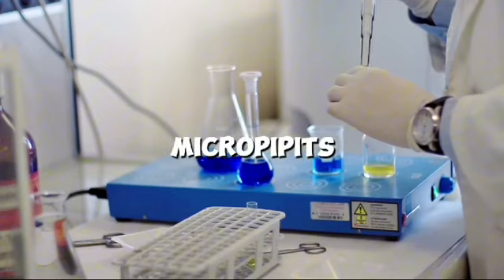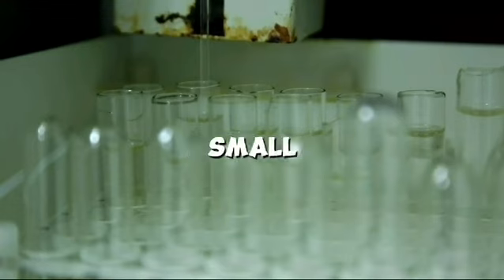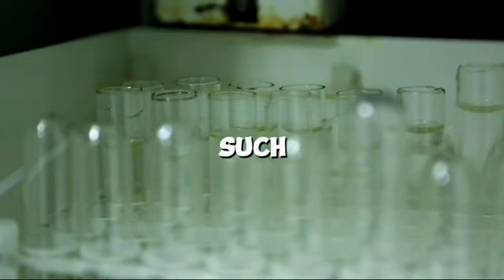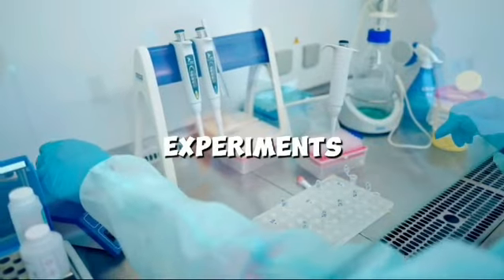Pipettes and micropipettes. Pipettes and micropipettes are used to accurately transfer small volumes of liquids. The precision is fundamental for many laboratory procedures, such as preparing solutions and handling samples in experiments.